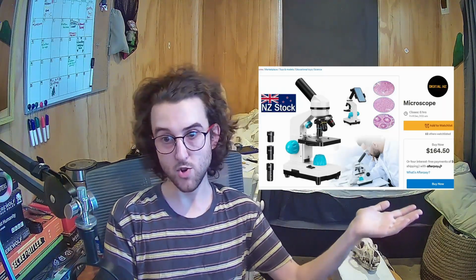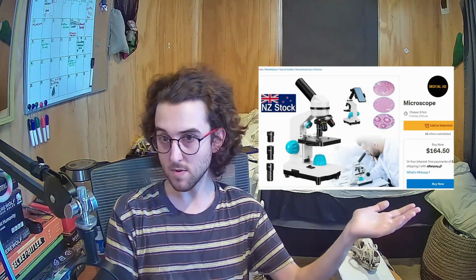Once you have taken your traps in and you've got your dead wasps, I would head on over to your lab, chuck the wasps in a petri dish, and then take a photo of them through a microscopic lens. If you don't have access to a lab, don't worry. The equipment is completely affordable for the everyday person. It's only $8 for a pack of 20 petri dishes, so you can buy a couple, that's not so bad. And I found this microscope on Trade Me for a reasonable $164.